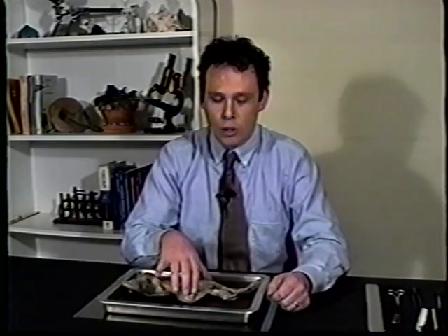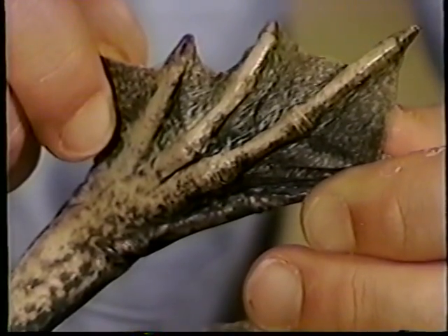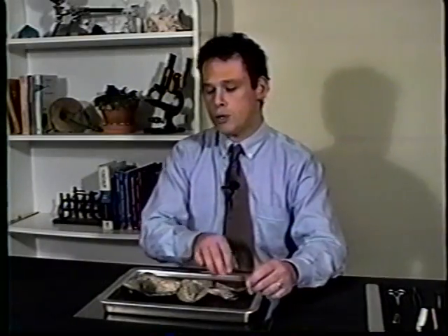The posterior legs are indeed used for locomotion. The long muscles allow for great springing action on land during jumps, and the webbed toes allow this frog to swim quickly and effectively. As you can see, our specimen is highly mobile, both on land and water.